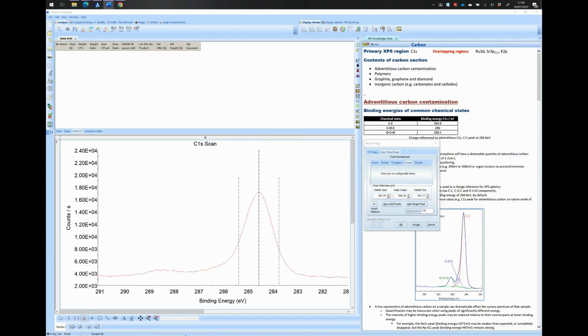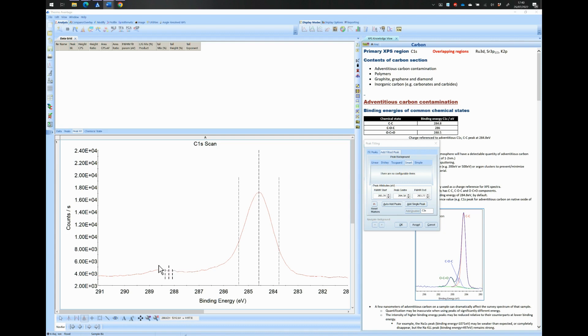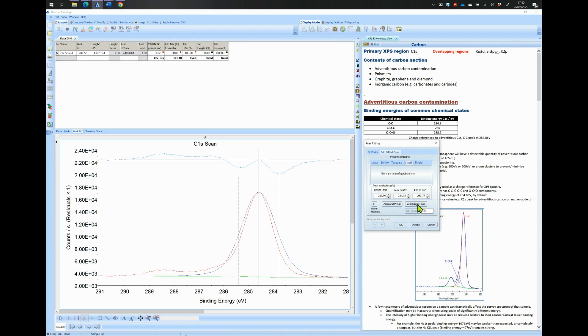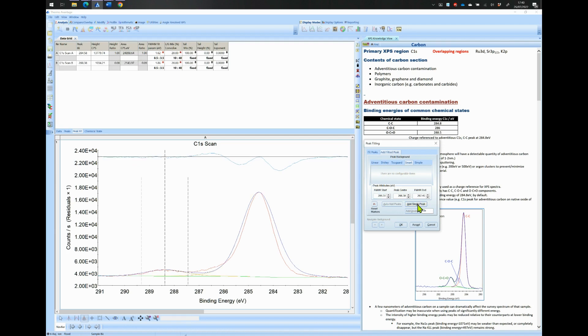Add the number of peaks that you can visually observe. In this particular case, two peaks are clearly observable. Add one peak around 284.5 eV and another peak around 288.5 eV.